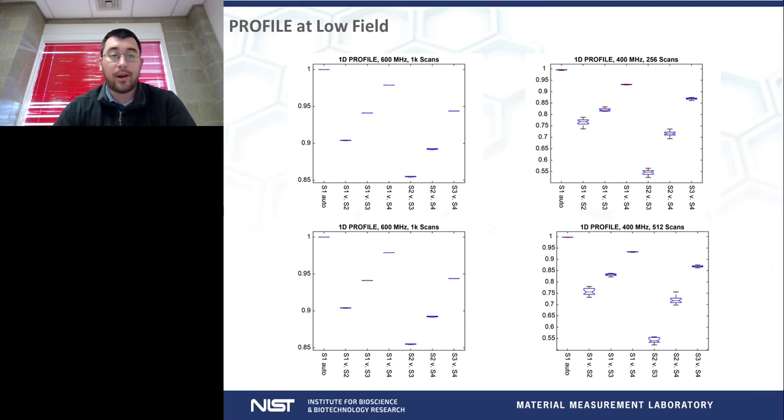This data takes approximately an hour and 30 minutes to acquire. And the top and bottom are the exact same data points. I just organized it that way to illustrate a point.